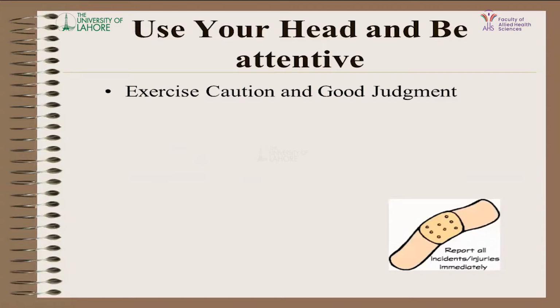Biosafety is very important and is the backbone for the safety of ourselves and the environment. If we define biosafety, it is all about practicing rules and regulations that are given by different authorities and institutes like JCI and the College of American Pathologists and different international organizations. Biosafety means using all procedures, standard operating procedures, principles and equipment to prevent an exposure that could harm ourselves, the personnel working in the laboratory, and that could spread out into the environment.